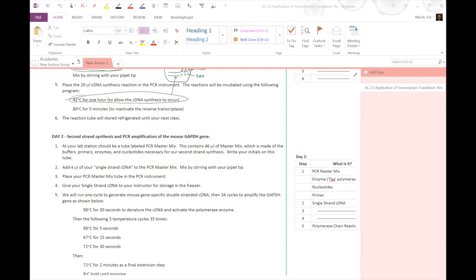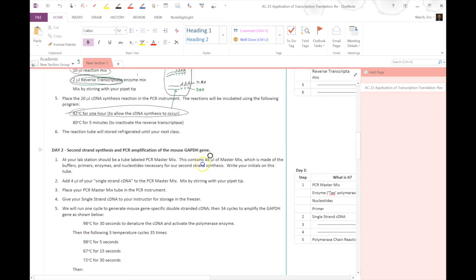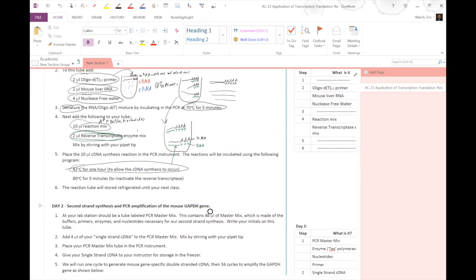Hello students, this is day 2 of the RT-PCR Lab. Now, if you recall what we did yesterday, we took our tube and made some cDNA copies of all the mRNA our mouse liver would produce.